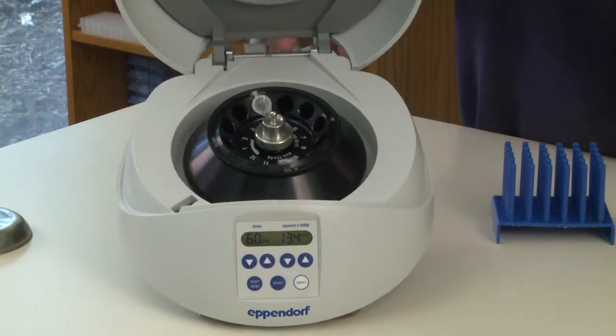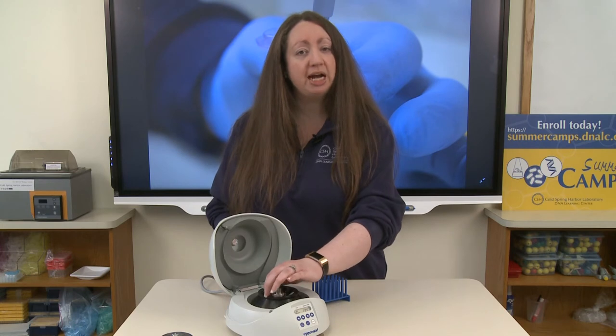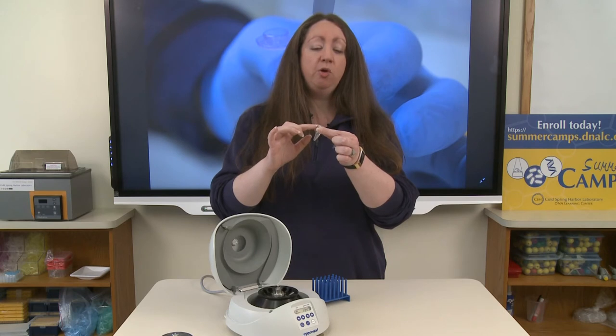The other important thing is to place the tube inside of your rotor with the hinges facing away from the center of the rotor. This is important because your tubes do not spin straight up and down. The pellet I'm looking for may not be very large. If I spin with the tube on an angle, I know the pellet will be at the bottom of the tube right underneath where the hinge is.